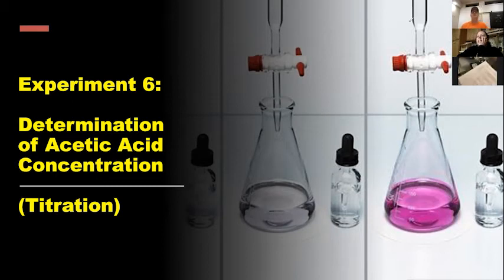It does have something to do with reactants being mixed. So what is it you're trying to determine when you're doing a titration? Yes, Karina, you're determining concentration. That's right. So basically, when you do a titration, you have a solution of known concentration, and you're using that to calculate the concentration of an unknown solution.